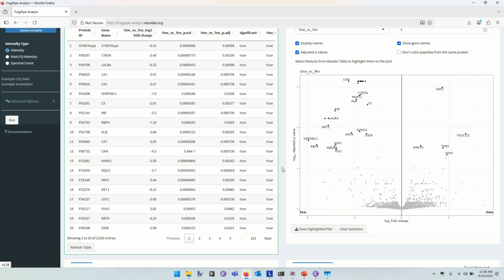Now, I told you don't just generate a bunch of t-tests in Excel. One of the reasons for this is the abundance of those zeros in the table. Having a bunch of zeros there will not do you any favors in the t-test because the zeros look like they perfectly replicate, and so they have no variance within a cohort. That's a real problem for artificially boosting the negative log of the p-value.